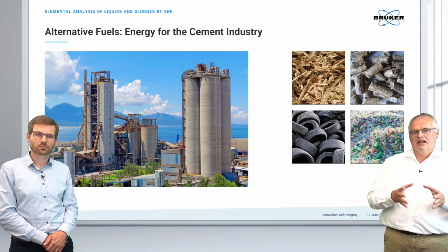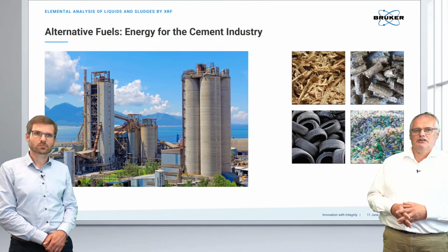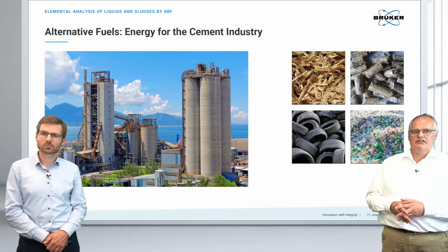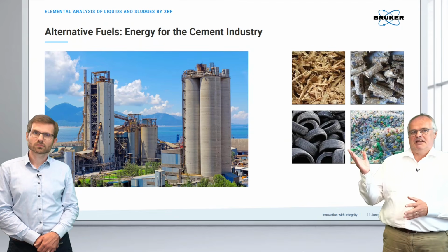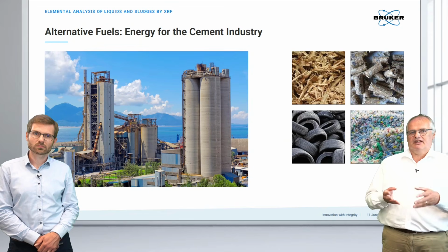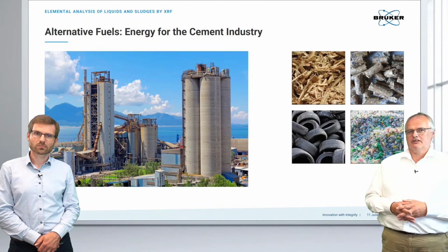On the one hand, the elements which end up in the cement, like chromium, that's regulated. We don't want to have this. Aluminium and phosphorus can change the setting behavior. And of course there are some toxic elements like cadmium. Imagine there are steel wires in these tires. They are zinc coated, and there's always a little bit of cadmium inside. So we need to monitor the cadmium for environmental reasons.